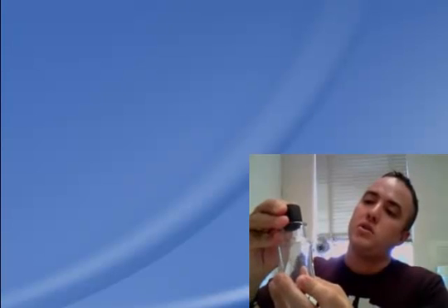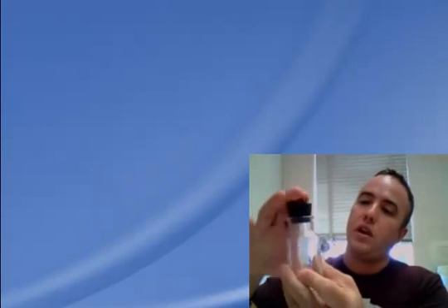From that point on, we're going to find the density of an unknown liquid, which is going to be a type of alcohol you will have. Y'all won't have all the same ones. So you're going to pour the water out of this. You'll dry it out real good. You're going to pour your alcohol inside. You'll make sure that there are no air bubbles in it, forcing them out, and you'll dry the outside of it to make sure that there's no alcohol on the outside surface because that weighs more.